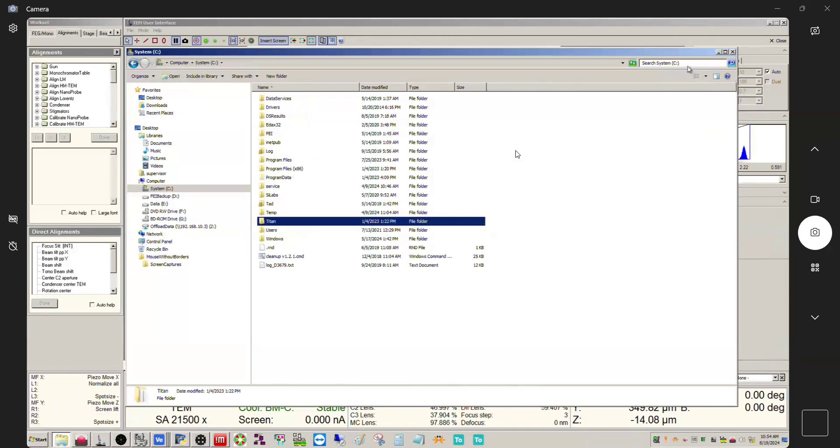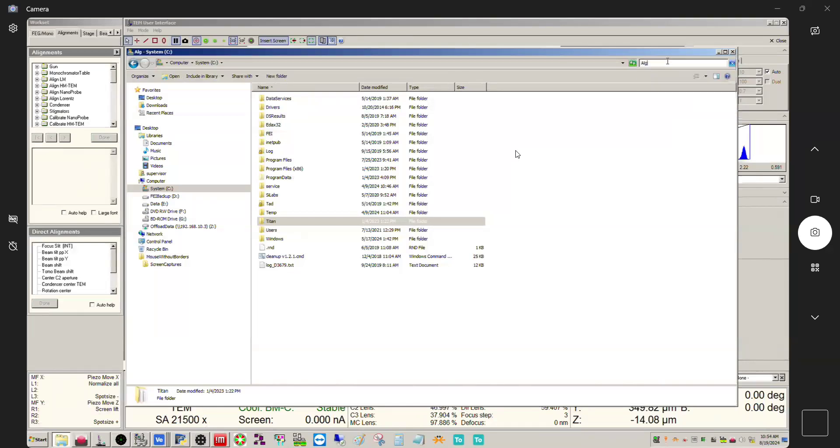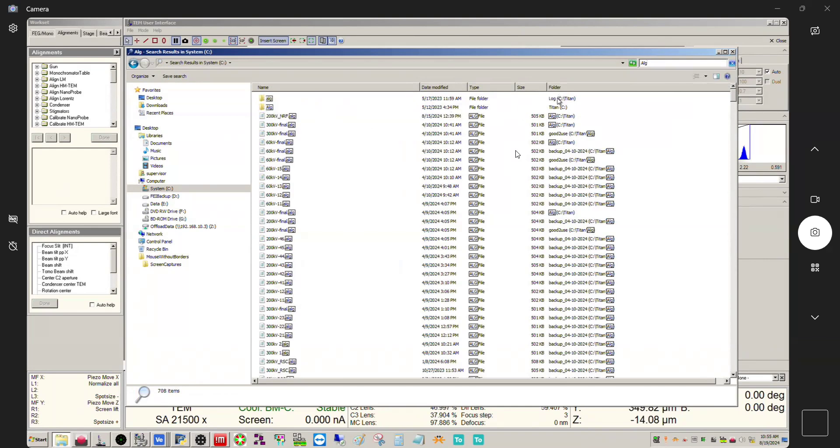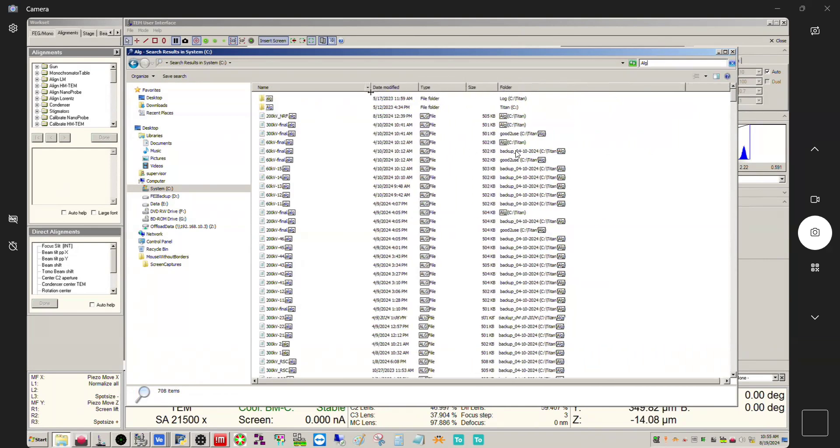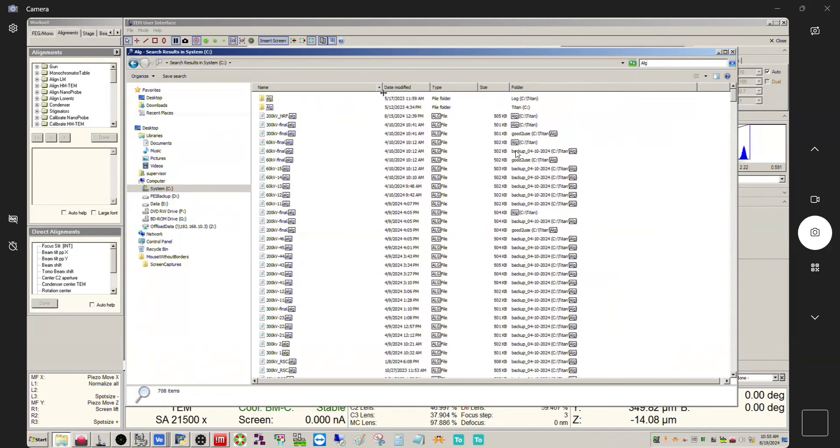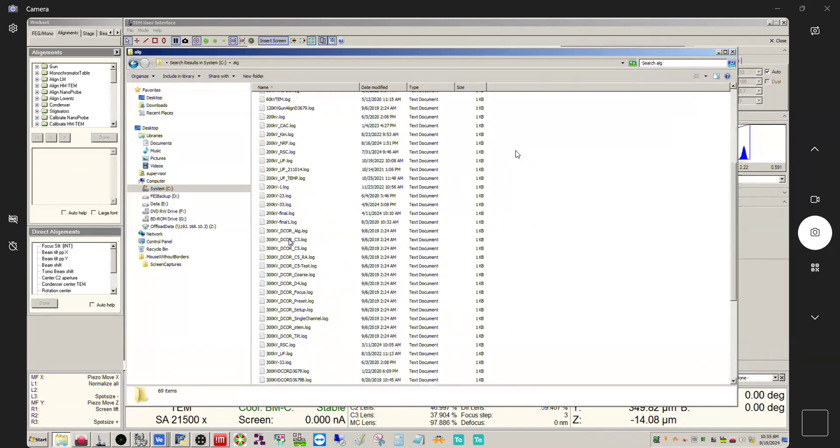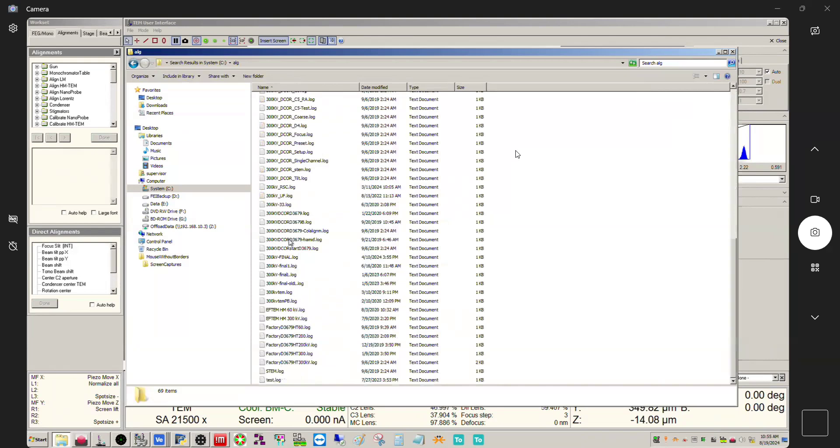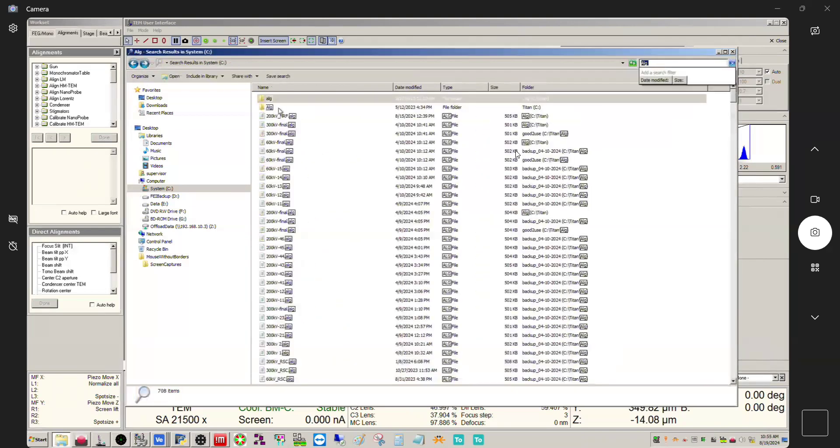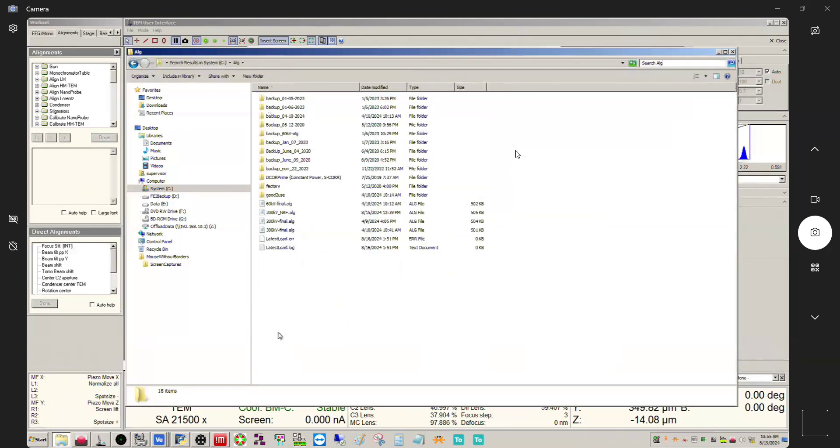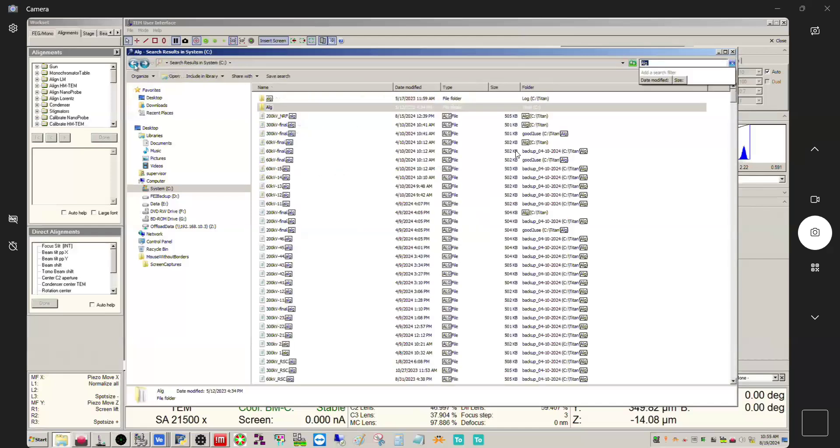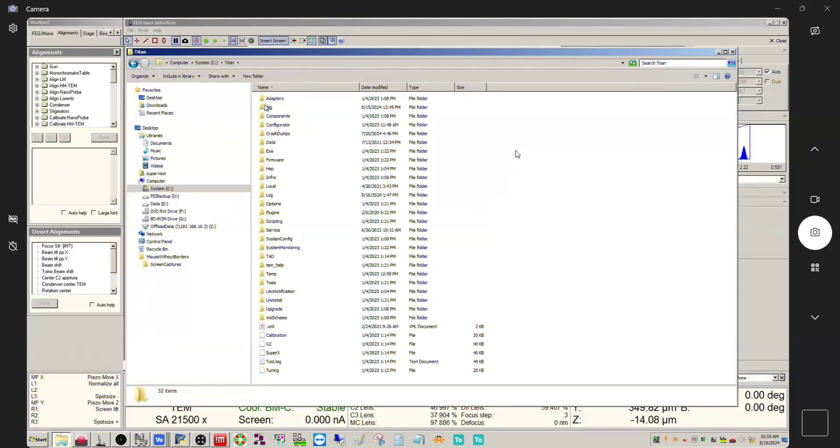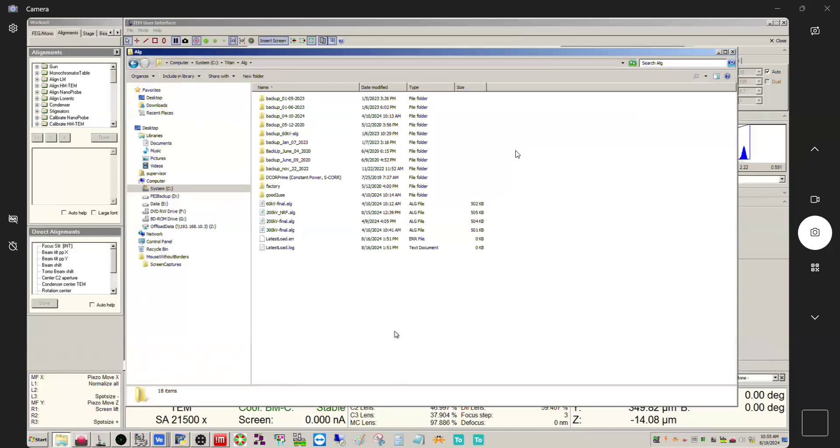Back to this alg folder - I wonder actually if we search system if it will come up. If we just do alg, yeah so it actually comes up here. There's actually two of them here, there's a lowercase and there's uppercase one. This is a log file so this actually isn't the files themselves. This is the one here. That's the other way you can do it - you can just search your C drive for capital alg and it will come up that way.